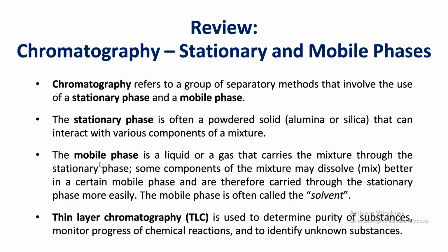And the last definition we want to go over in this slide as a review for our lab is thin layer chromatography, abbreviated as TLC. This is a method used to determine the purity of substances. So, this is a quick way to figure out, is my substance pure or is it a mixture? If it's a mixture, you'll begin to notice the separation of different layers, and these layers are shown as dots on the TLC plate. And if your substance is pure, you'll only see one dot. So it's used to determine the purity of substances, monitor the progress of chemical reactions, and also used to identify unknown substances.